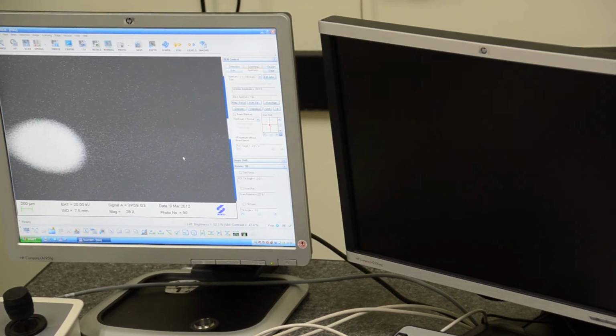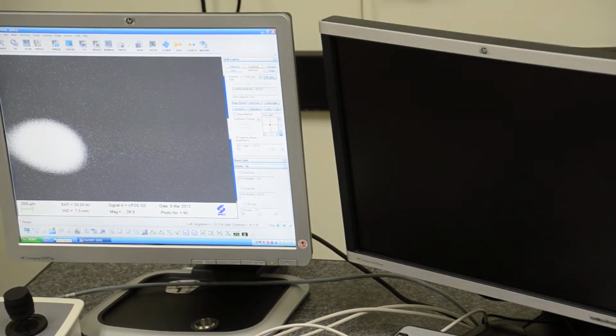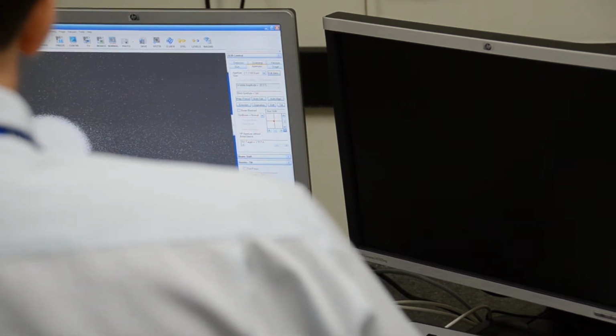You need to change the aperture over here. You need to change to the 750, the larger one. Yeah, 750. You'd better write down the current position, the Y. The Y now is 6.1. The 300 is, let me look at that, about 9.